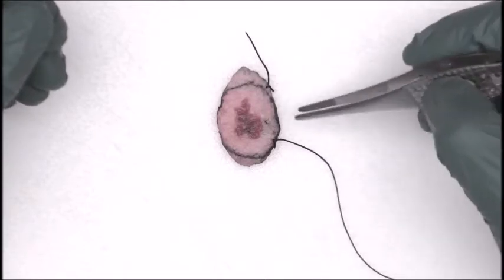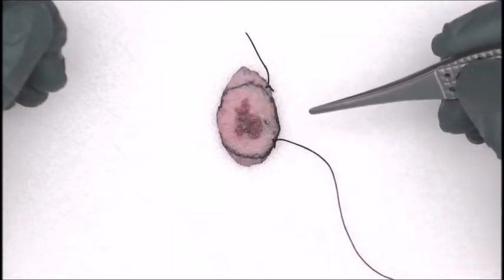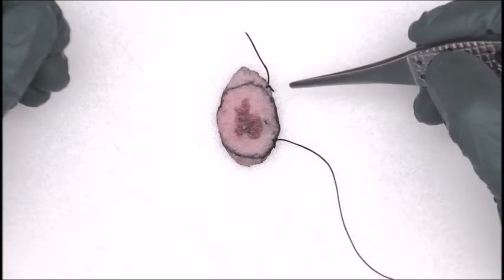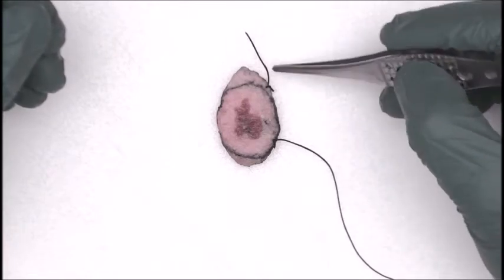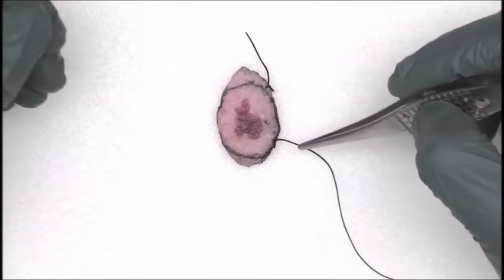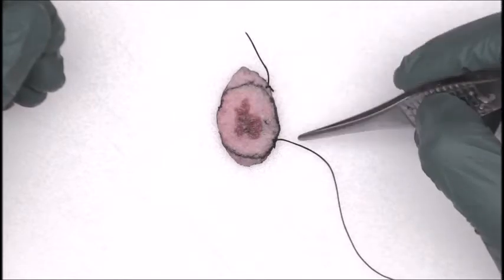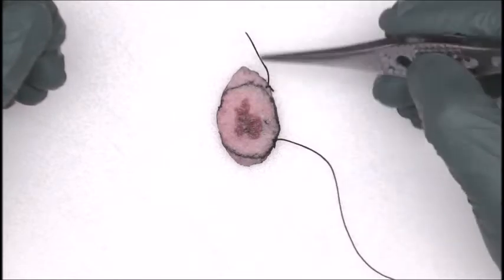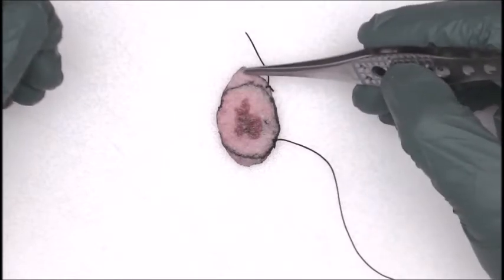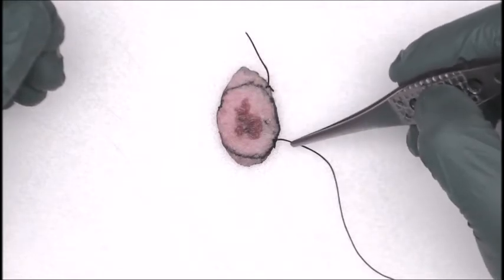Now I can keep those like they are, or I can redesignate them, which I'm going to do in this case because our practice does it this particular way. So this is a short suture, superior, long suture, lateral. I'm going to redesignate these as 2 o'clock and 4 o'clock. So this will still be considered the 12 o'clock tip here. This will be 2 o'clock, and this will be 4 o'clock.